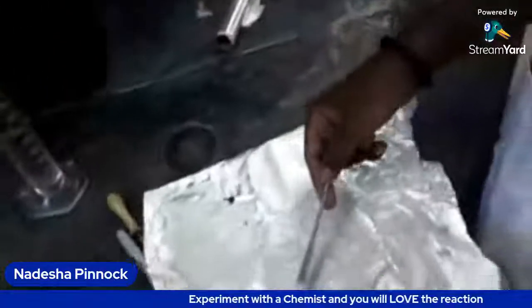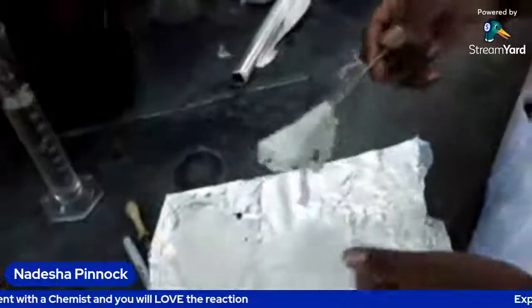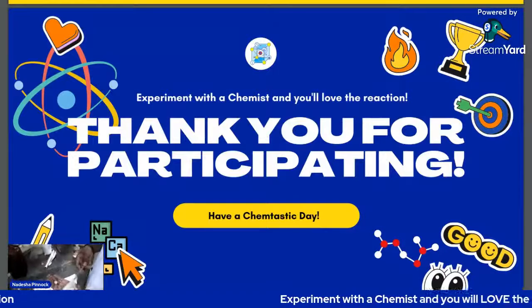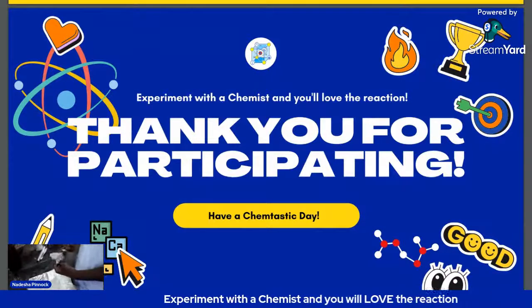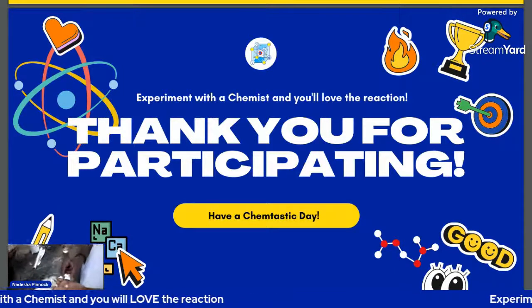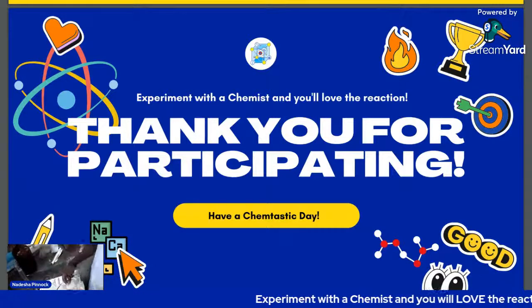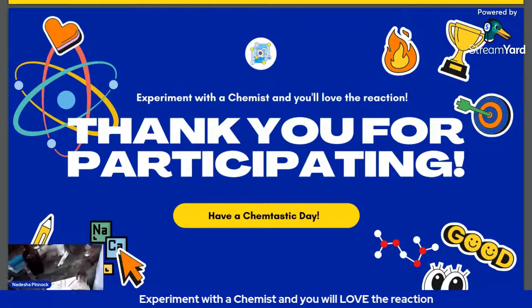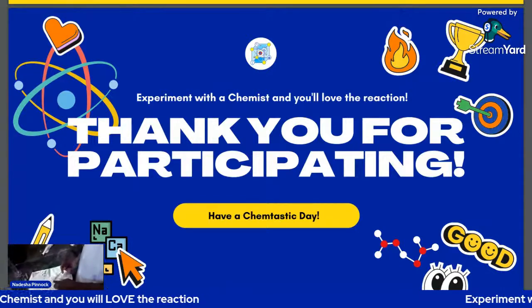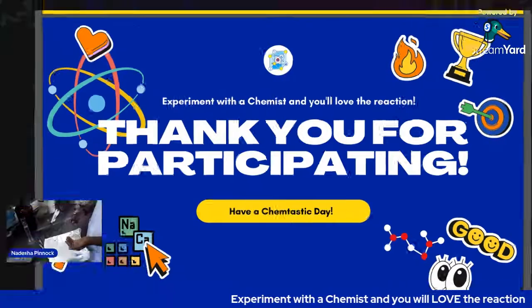Anyway, guys, that's the end of today's meeting. So we made some bioplastic. And, of course, you can try this at home. As I said, we're going to post the home version of the experiment where you can do your own bioplastic. For the glycerin, if you don't get glycerin, you can use a vegetable oil. It contains glycerin. It's not glycerin only, but you can use it as a substitute. But glycerin is sold at the supermarket, actually, so it's not hard to get.